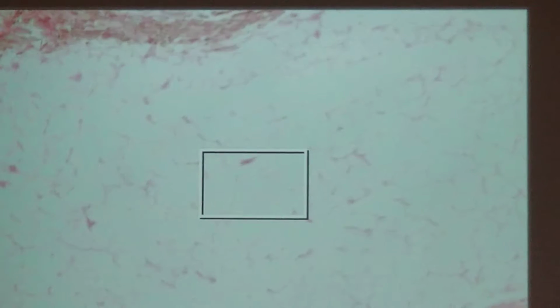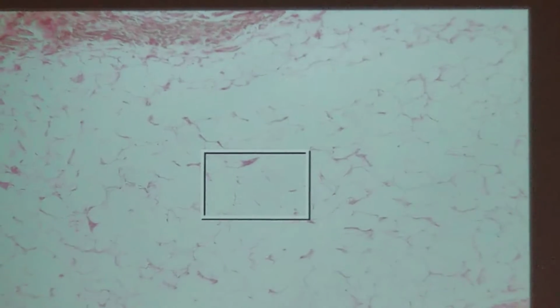Next, adipose tissue. You can actually see this on the second slide too. If you go to the skin, you go to the lower level of the skin. So you go to here where it's really kind of just clear. You can go lower down, right? And it's very pale. So once you get it focused in there, you can see the cells a little bit better. Come down into here.